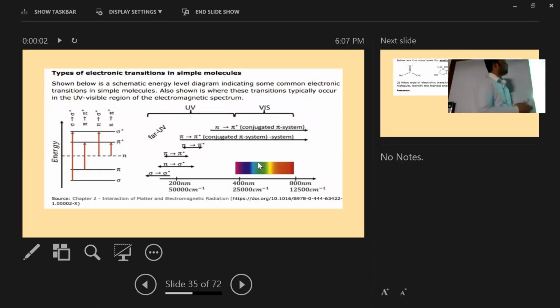Okay, here we have some. You are familiar with these types of structure? The energy level of different types of bonds. This is the non-bonding electron. It has no anti-bonding. Non-bonding electron, there is no anti-bonding. So anywhere, if a molecule is bonded, then it becomes very stable, and depending on how stable the bond is, the bond energy becomes low. For single bond, the energy is minimum.